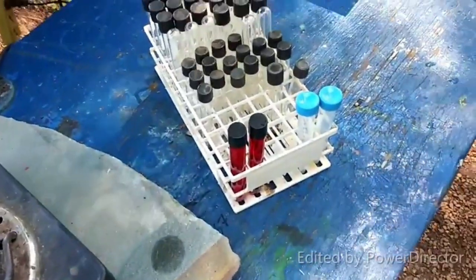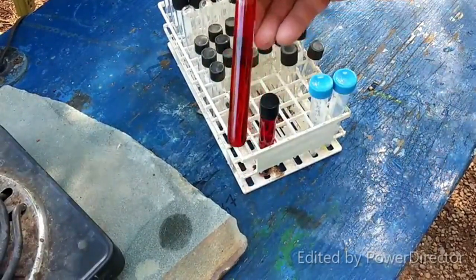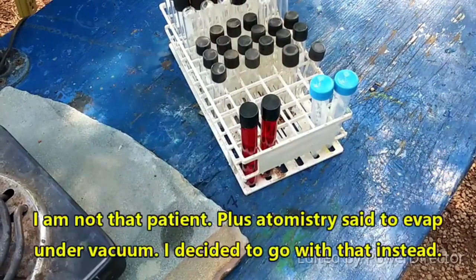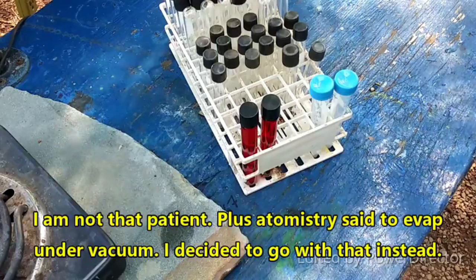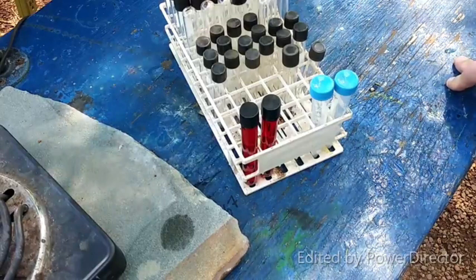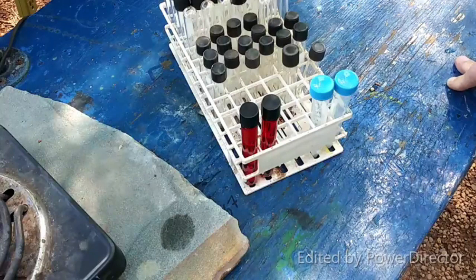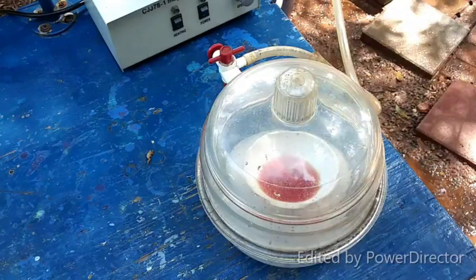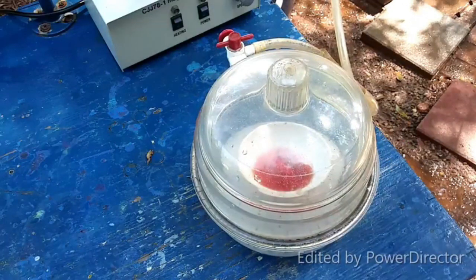And with this, since it's only a small volume anyway, maybe pour this into a small beaker and just let it sit out until it evaporates. As hot as it is around here, it probably won't take that long. I could dry it over some phosphorus pentoxide, generously supplied by Backyard Science 2000. That's also an option. Okay, let's hope it doesn't decide to suddenly explode out of there all over the place. Clearly, heating it up was not working.